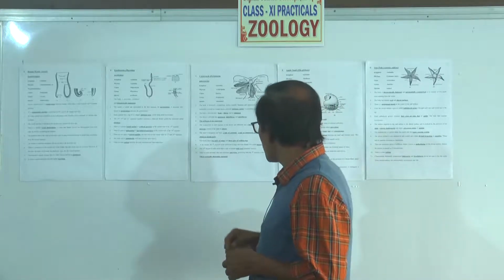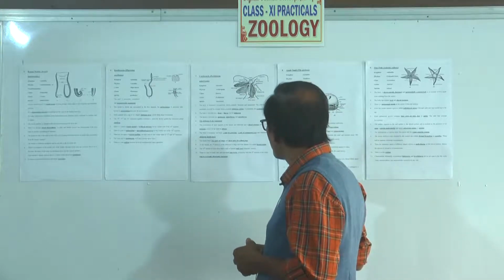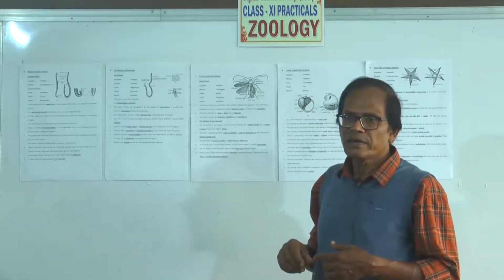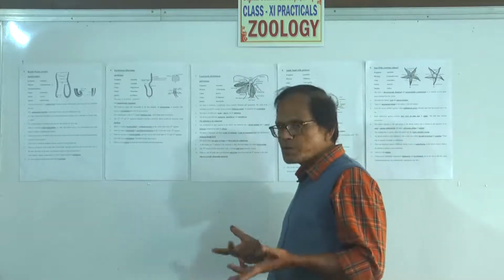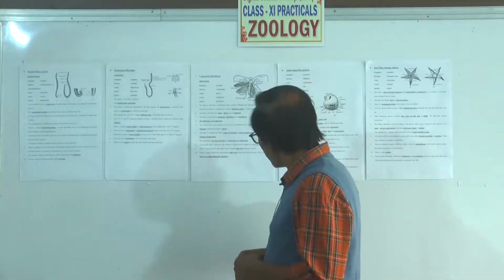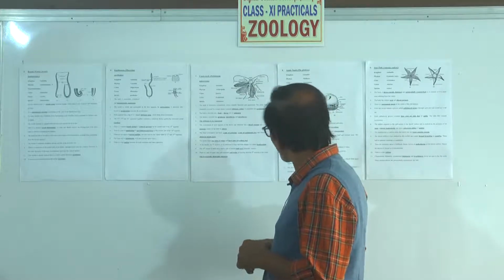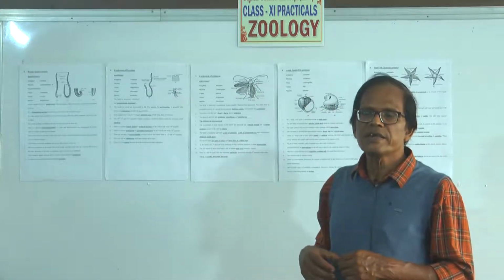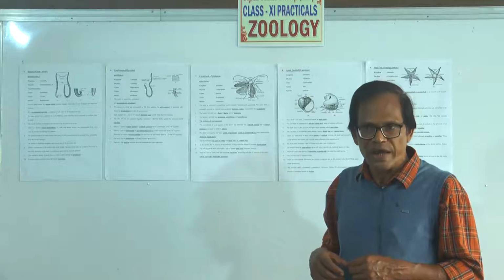The 10th tergum in both sexes, both in the male and female, bears a pair of jointed anal cerci. There is a pair of small, thin and unjointed anal styles projecting from the 9th sternum of the male. This is exclusive to the male cockroach, anal styles.